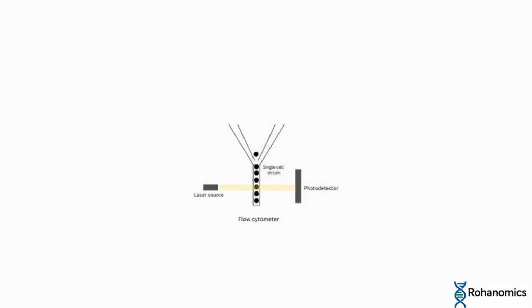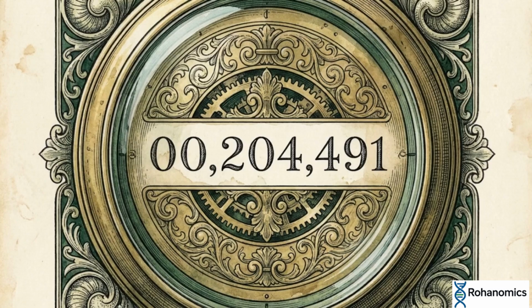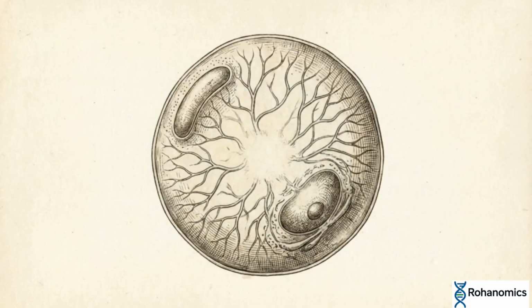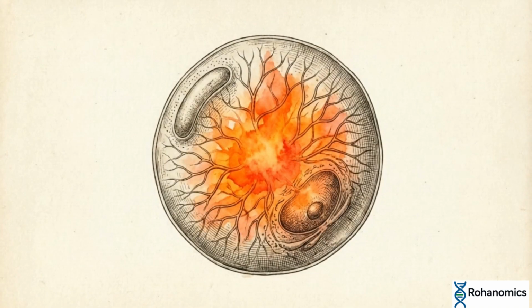This diagram illustrates flow cytometry. It uses a fluidic system for hydrofocusing, forcing a dense suspension of cells into a strict single-file stream. As each single cell passes the targeted laser beam, a photodetector measures the specific diffraction event, logging a precise physical count. Flow cytometry achieves high physical precision by automating the count. Yet, without specialized fluorescent tags, it still fundamentally counts physical objects rather than confirming cellular health. To prove viability, the biological requirement changes. We have to stop measuring physical shapes and start measuring active metabolic engines.